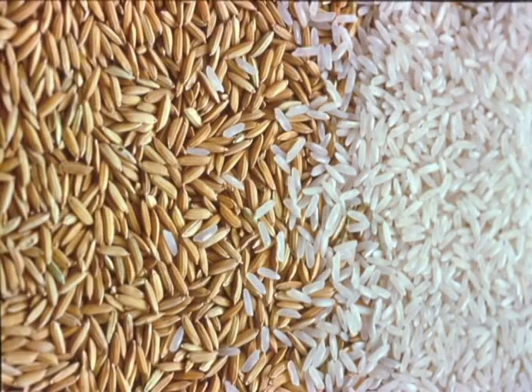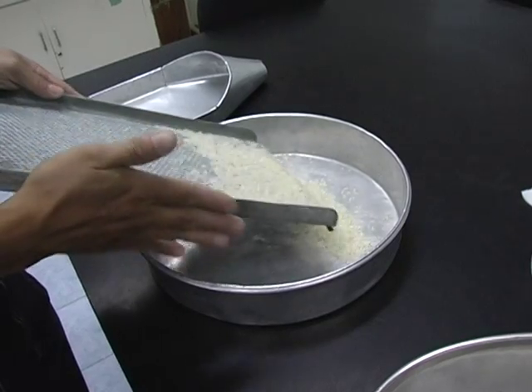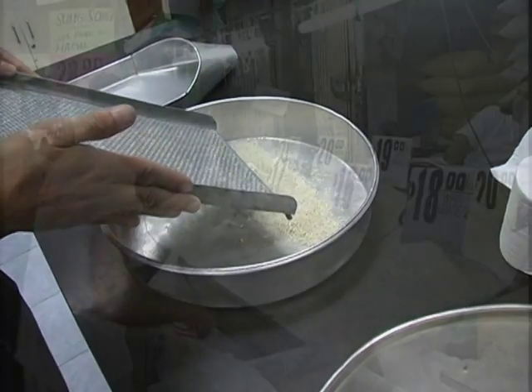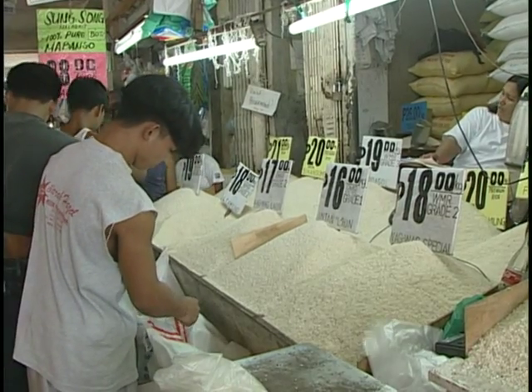Those are the basics of determining and measuring white rice quality. Follow each of these steps carefully to ensure accurate measurements. Remember, better quality grain equals better market value.